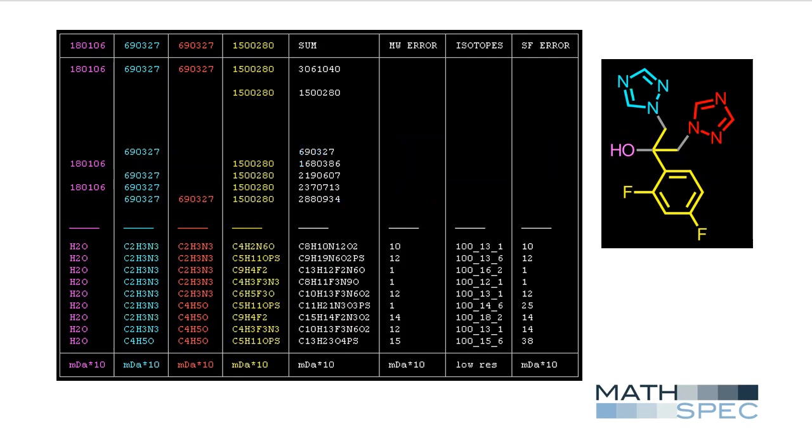As shown previously, a single subfragment mass can match multiple subformulas. The correct formula and subformulas are often difficult to determine, and so we use subfragment masses for searching Pubchem Compound for matching molecules. Note that the corresponding substructure masses, for example 68.0249 Daltons, may vary in mass from the corresponding subformula masses by the mass of an integral number of hydrogen atoms.